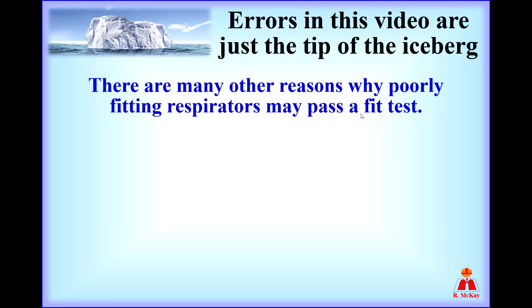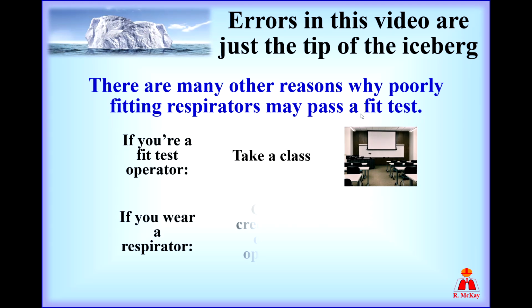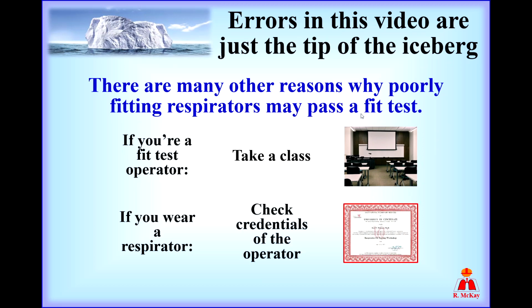So the errors in this video are just the tip of the iceberg. There are many other reasons why poorly fitting respirators may pass a fit test. If you're an operator, I would highly recommend that you take a class to be sure that you're conducting the fit test properly. If you're a respirator wearer, you should consider checking the credentials of the operator so you have a higher level of confidence that the test is being done correctly.